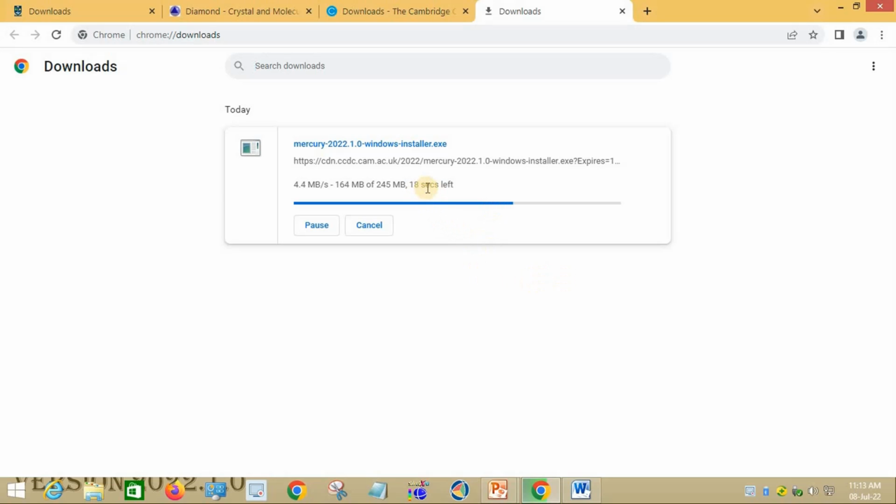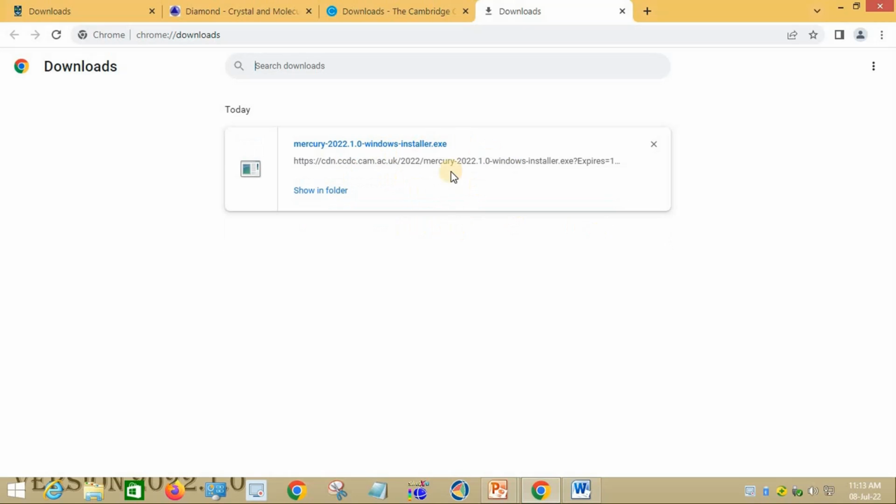It will take some time, 16 seconds, 15 seconds. This is the installer. It will take a few more seconds, and it will be downloaded. Now you can see it is almost done. Yes, now the program is completely downloaded. Now you can install it. Just copy this installer into another directory.